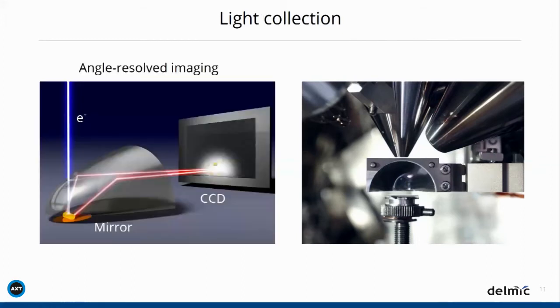So by doing this, you have an additional advantage. When it is perfectly aligned, the beam is perfectly collimated. And if you use a two-dimensional CCD array, you can actually image the full beam that comes from the paraboloid, and you can correlate different positions in the CCD image to different positions on the paraboloid, and those correspond to different emission angles. This means that you can do Fourier imaging or angle-resolved cathodoluminescence imaging, so you can measure the angular profile, and this can be highly useful in several applications.